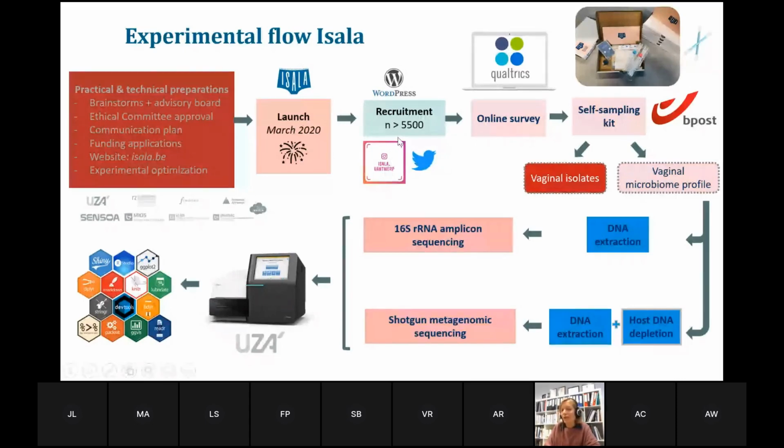And we decided to invite all women to donate and swap if they wanted to, because we thought it would be really nice to have a large sampling pool of Lactobacillus natural biodiversity. All women received the sampling kits, and they sent us back 2 swabs, one for vaginal DNA analysis, for the vaginal microbiome profiling. Most of the samples were done by 16S amplicon sequencing, but also part done by shotgun sequencing.